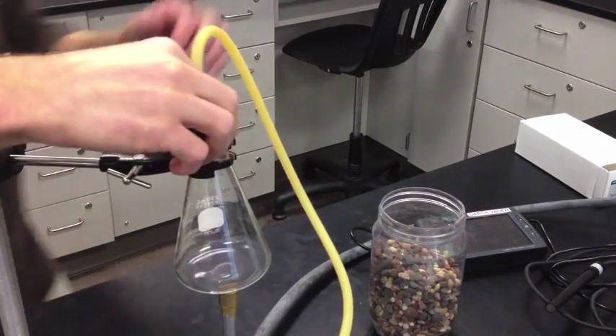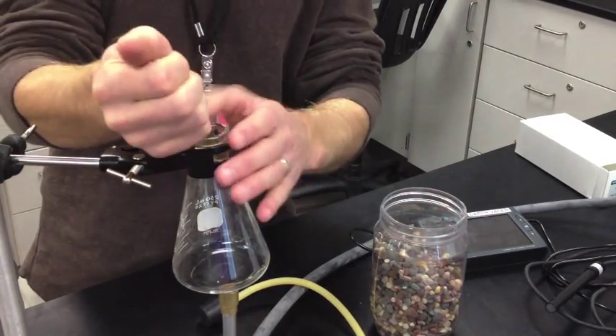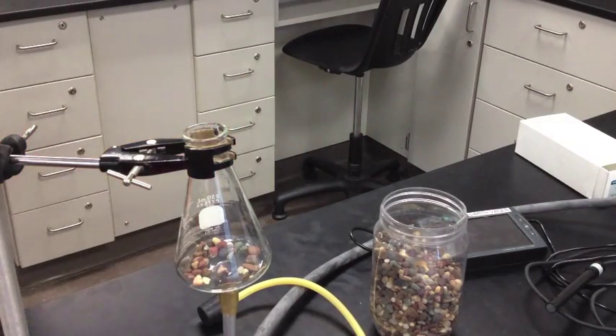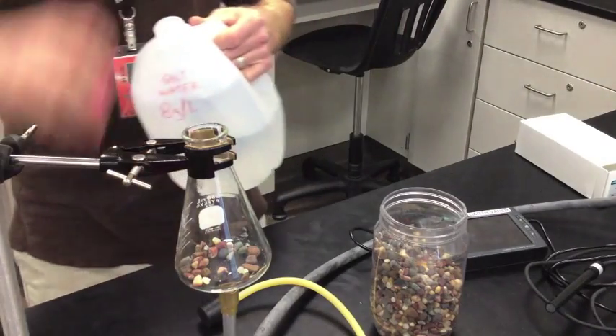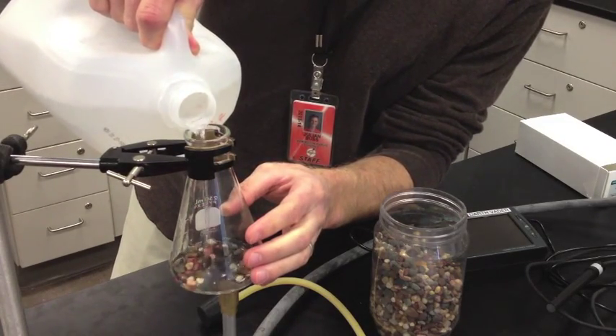To your 250 milliliter Erlenmeyer flask, go ahead and add a small handful of rocks. Those are boiling chips that are going to allow the saltwater to boil at a normal amount without over boiling. Also add 100 milliliters of saltwater to the Erlenmeyer flask.